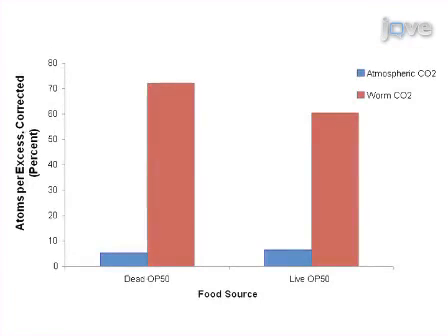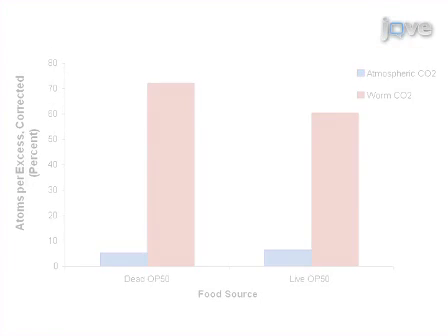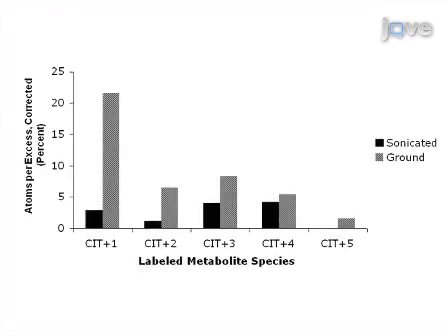Results are obtained that show effects of variable durations of isotope exposure, bacterial clearing, and alternative worm disruption in wild-type worms to interrogate isotopic abundance in intermediary metabolites. JoVE's method can provide insight into C. elegans intermediary metabolism. It can also be applied to other systems, such as mammalian cell lines and tissues.